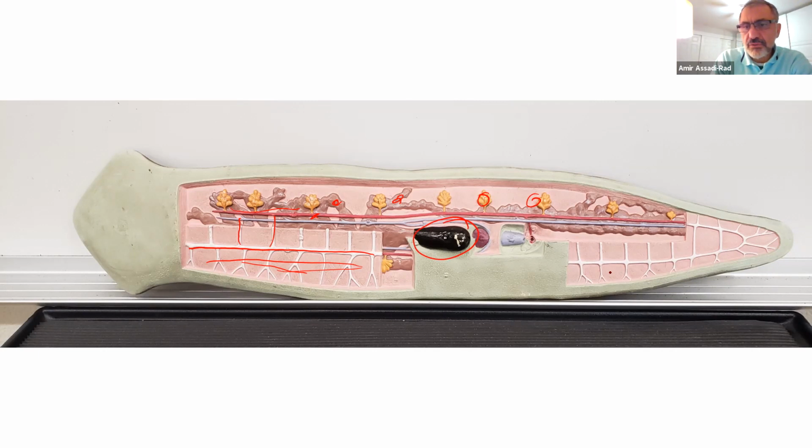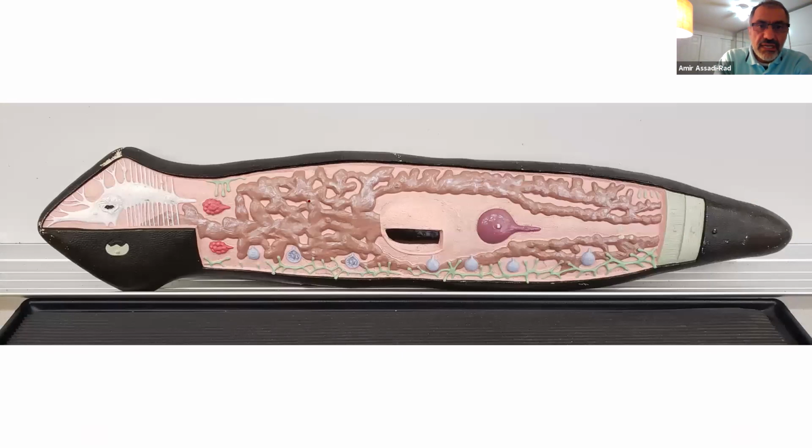I'm sorry, I knew I was not right. These nerves right here are called lateral nerves. So the gastrovascular cavity, the branches are called diverticula. Do not worry about this. Cerebral ganglion, ovary, and these are your flame cells or excretory canal. These are excretory canals, and these are flame cells.